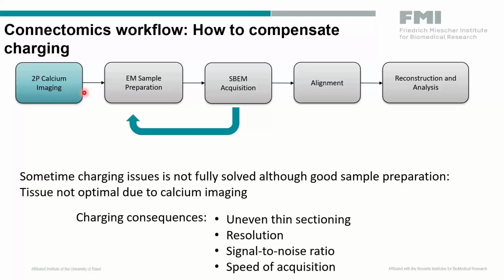Actually, we developed this FBROPA protocol on naive fish, fish that were not calcium imaged. Why? Because we don't want to use very precious samples prepared with calcium imaging to develop this protocol.